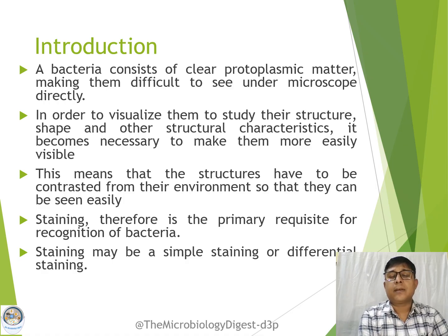So this can be achieved by applying some stains which give a contrasting color to the organism so that it can be differentiated from the background. That is why staining is a primary requisite for recognition of bacteria and any microbiological procedures whatever we want to perform.